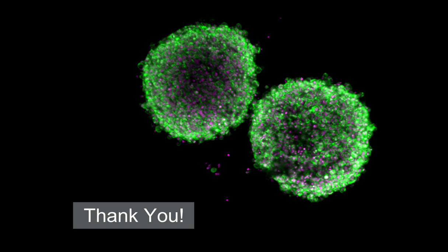Oh, yeah. Towards the beginning, we looked at a couple of different models. One where we're just using a standard round bottom 96 well plate. When we seed adherent cells into that type of dish, the untreated round bottom dish, sometimes we'll see multiple spheroids form. We'll see multiple larger structures form, but it's not just one round spheroid.